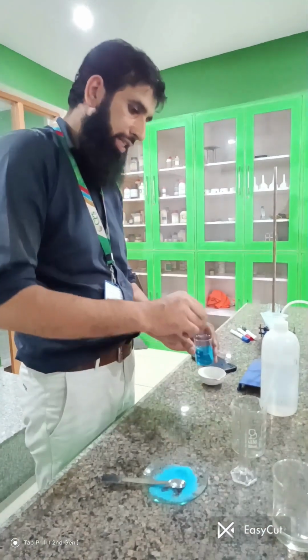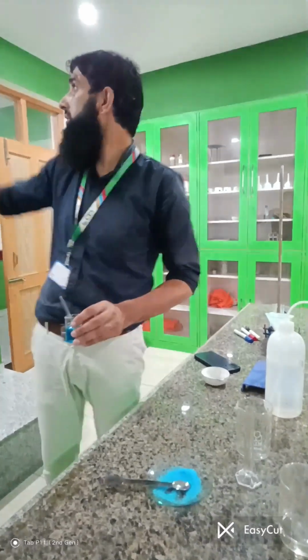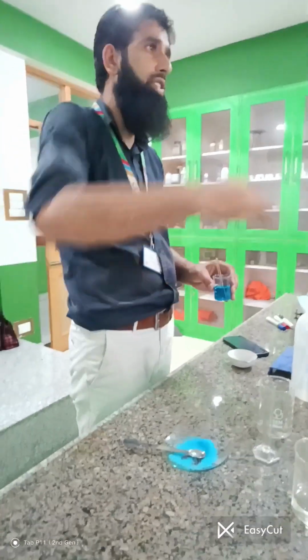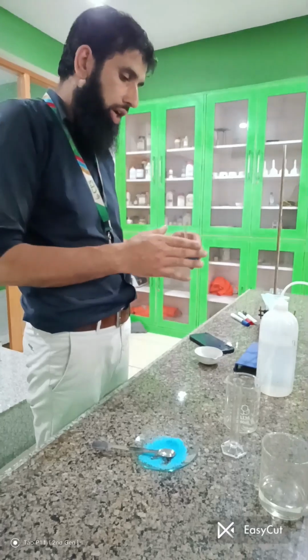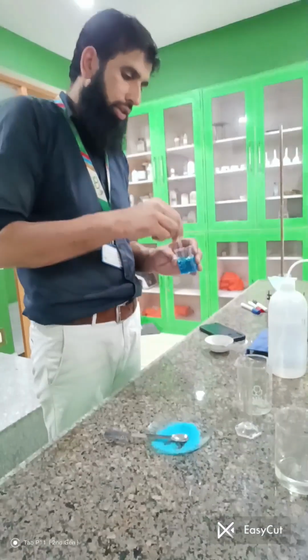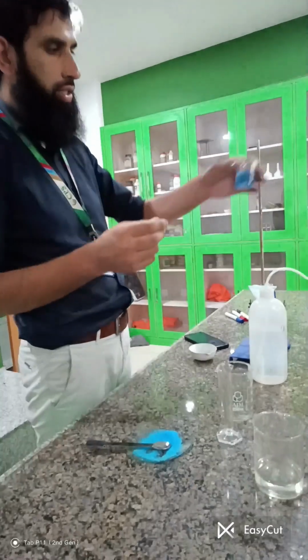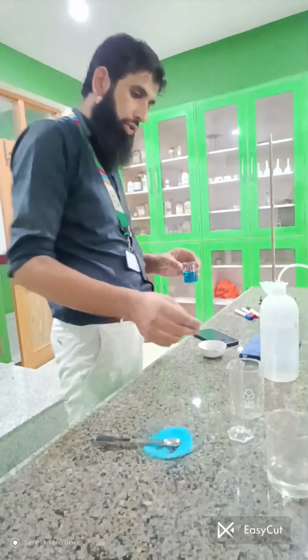What is the purpose of adding sulfuric acid? Because it prevents the decomposition of crystals. We have a copper sulfate solution. If we do not add sulfuric acid and directly start heating, these copper sulfate crystals will decompose. So in order to prevent the decomposition, we have to add some sulfuric acid. And the solution becomes crystal clear. After that, we have to filter it.